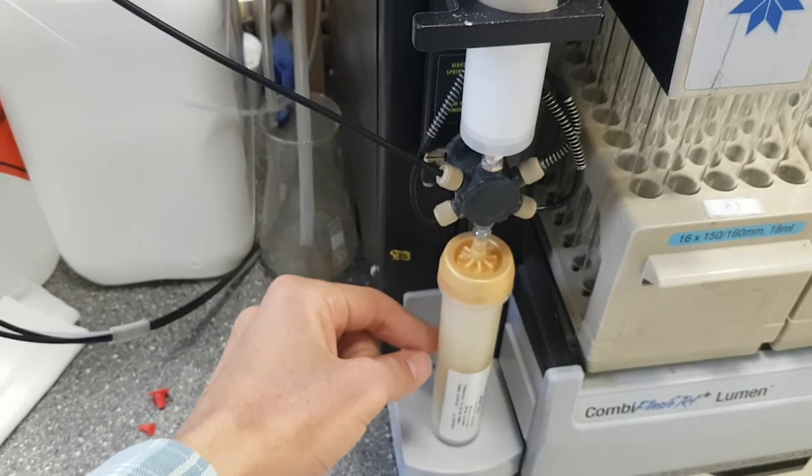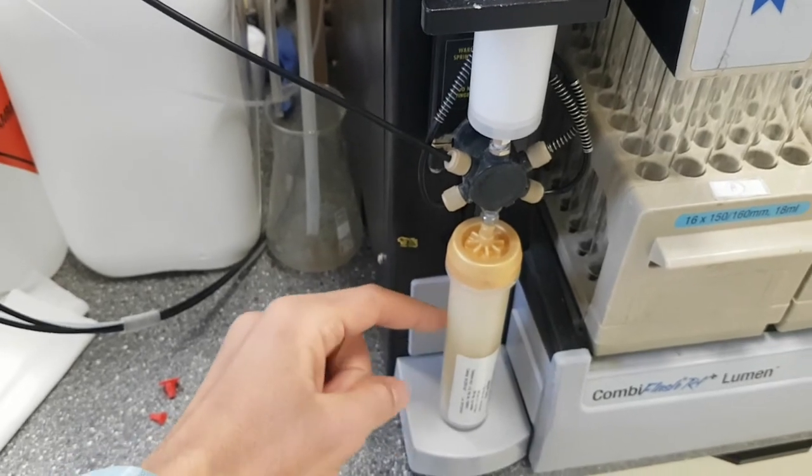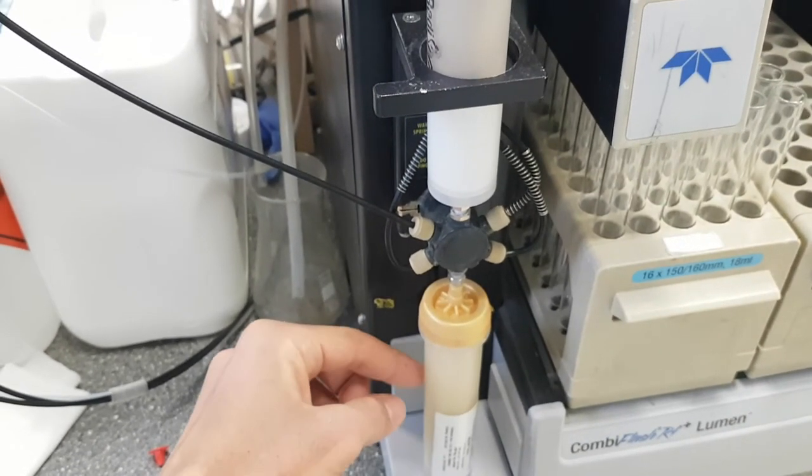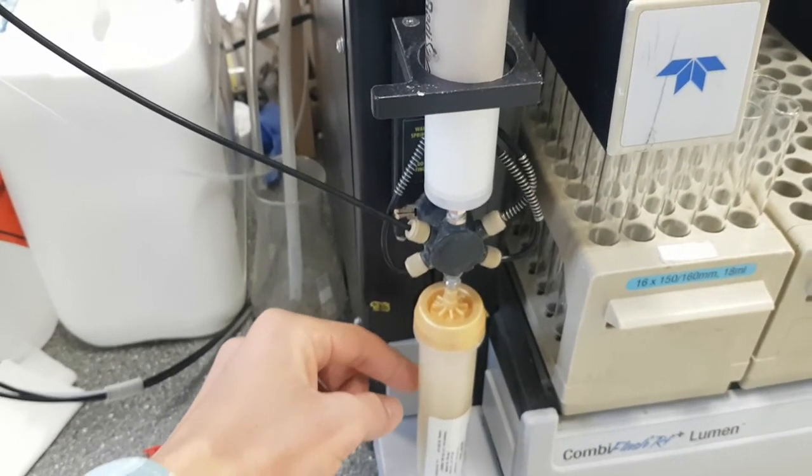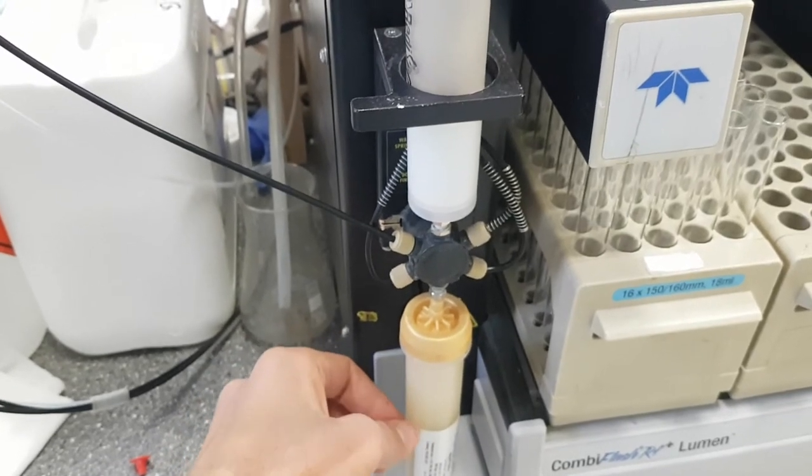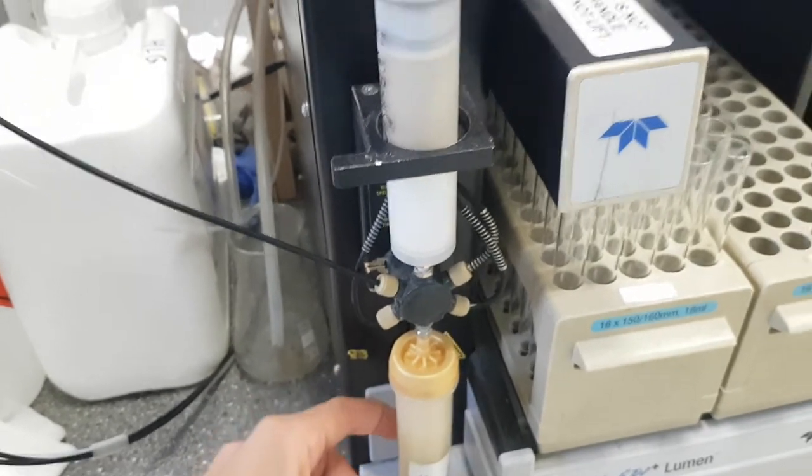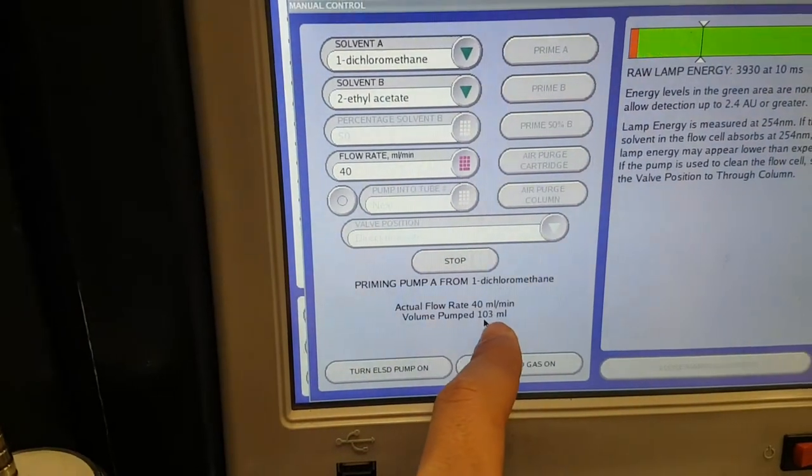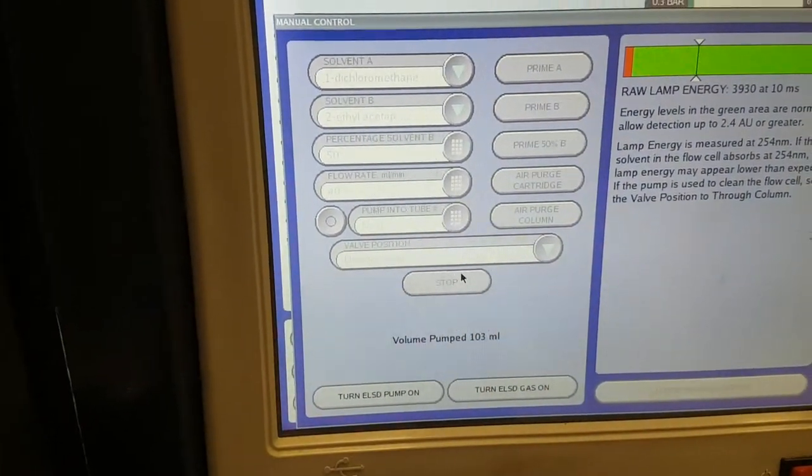When I finish, usually I wash it with ethyl acetate because if you let the methanol, the methanol can destroy the silica gel. Right here it's already finished, I'll stop it.